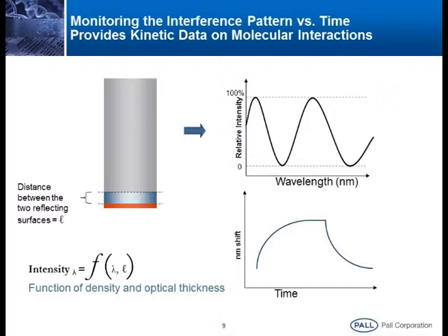So, we have to determine these affinity constants. If proteins are interacting strongly, this affinity is in the picomolar range.